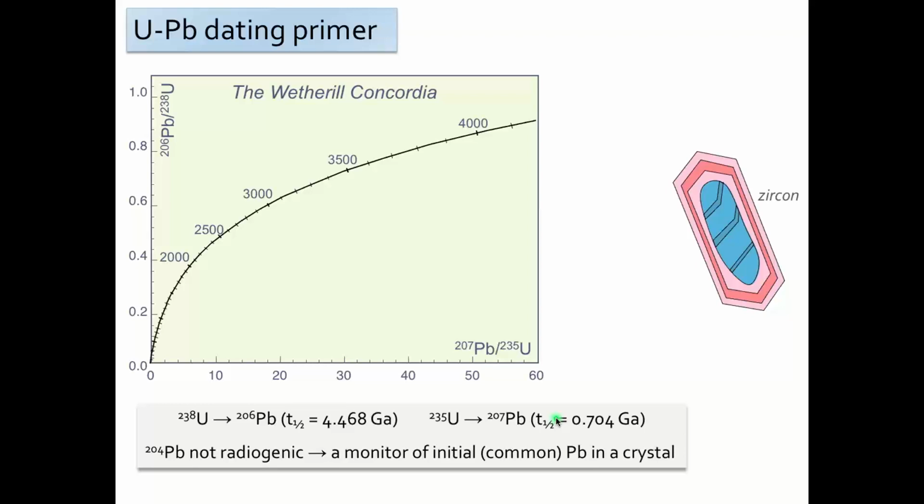So on the right-hand part of this diagram, there's a zircon. And we're going to do a spot ablation on the rim of this zircon. You can see it's got an oscillatory zoned outer rim. And it's about 1.5 billion years old. It's concordant, it plots on the Wetherill Concordia, and everything is fine. But you can see inside this cartoon zircon, there's also, if you like, a very discrete discontinuity inside the crystal. And this is an older inherited core.